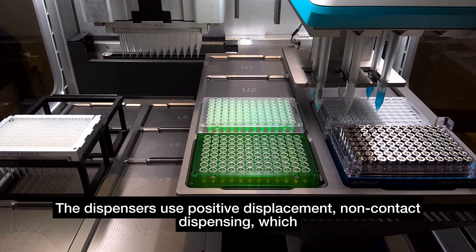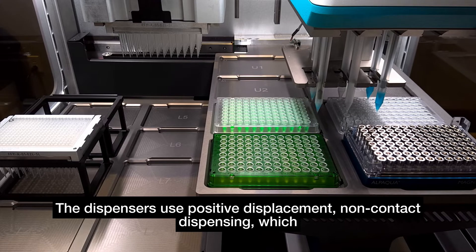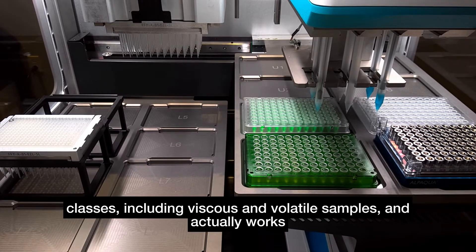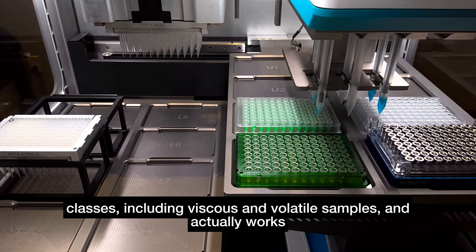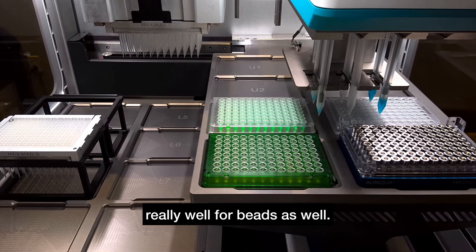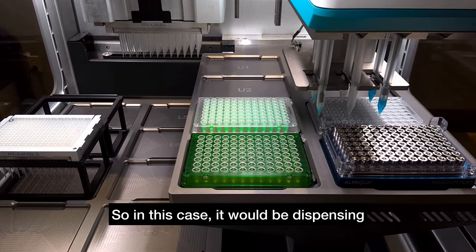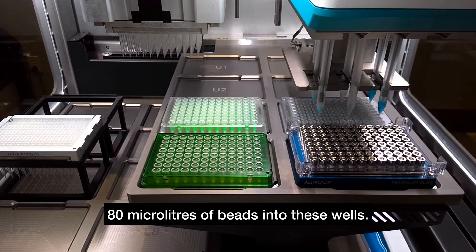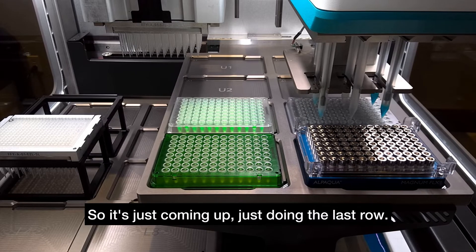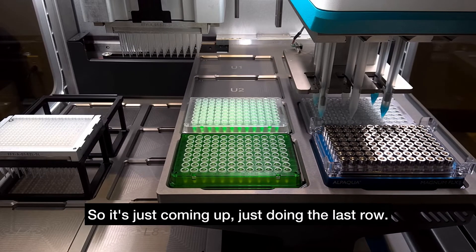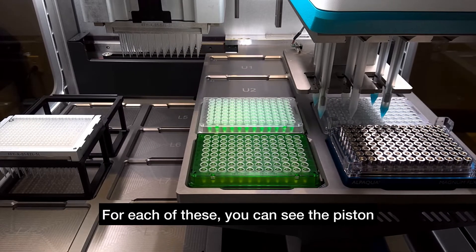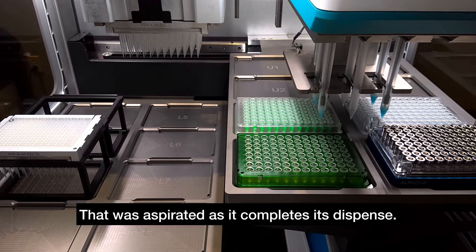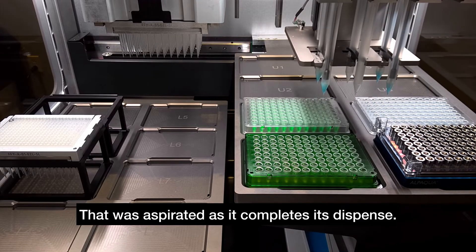The dispensers use positive displacement non-contact dispensing, which works really well for a wide range of liquid classes, including viscous and volatile samples, and actually works really well for beads as well. So in this case, it would be dispensing 80 microliters of beads into these wells. So it's just coming up, it's just doing the last row for each of these. You can see the piston working down to the end of the liquid that was aspirated as it completes its dispense.